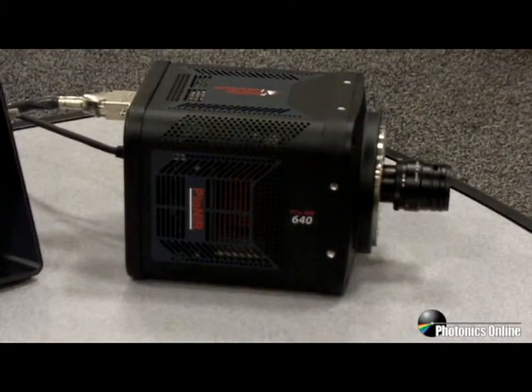The camera is expressly designed for low-light near-IR imaging and spectroscopy applications, such as singlet oxygen imaging, fluorescence from single-walled carbon nanotubes, and photoluminescence imaging of solar cells. The camera is capable of detecting the lowest levels of near-IR light.